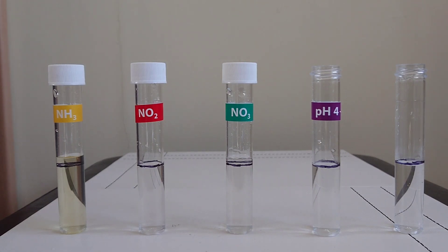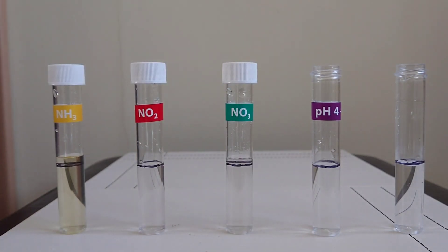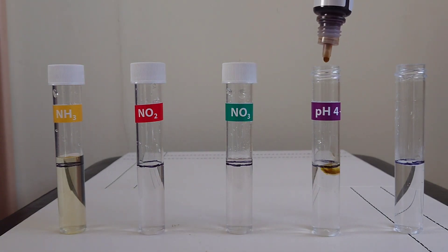Next we have pH. All this is is one bottle again, like the nitrite. This one is five drops and it develops instantly.